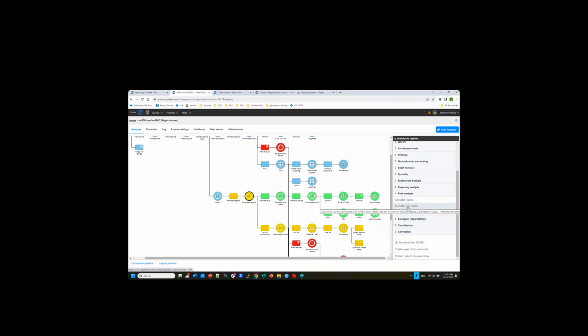Imagine each row is a cell and each column is a promoter of a transcript. But here, using Cell Ranger's algorithm, they combine all the transcripts at the gene level, using one gene as a unit to represent the promoter sum.